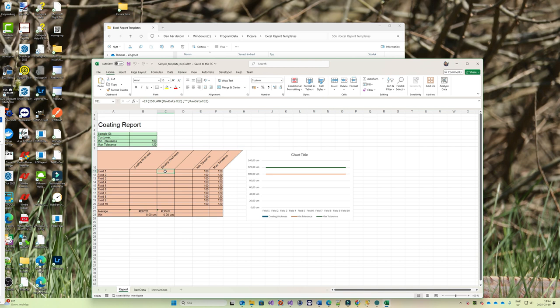The measurement process is to measure the binding thickness first and the coating thickness after. So we pick this from the E2 column, and this one obviously from the E3 and E4, E5 and so on. So every line increases with 2. So this will just populate the raw data. Over here is a chart, and this chart is obviously just picking values from the table on the left-hand side. And at the bottom, I've just added average to demonstrate and min to demonstrate the min value.